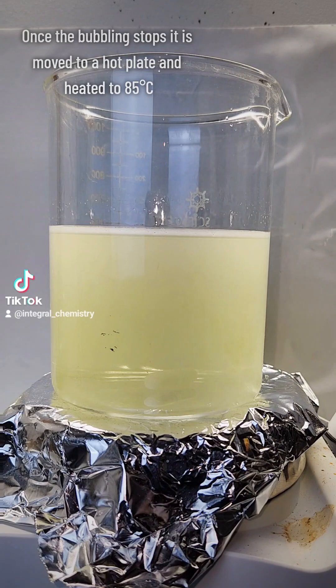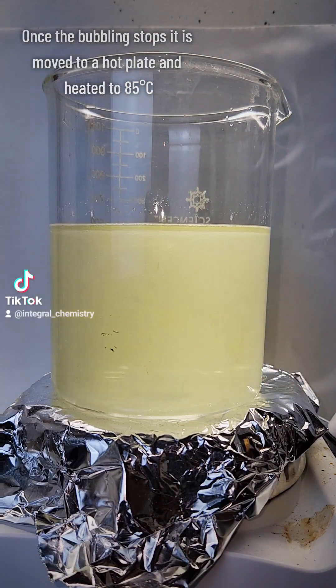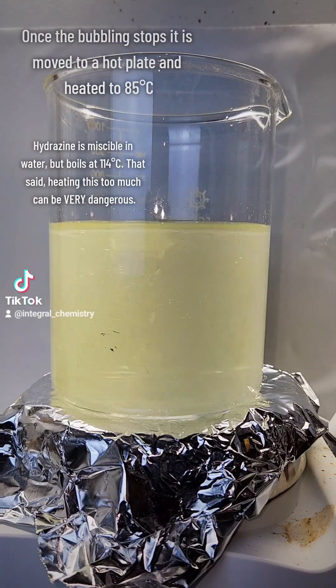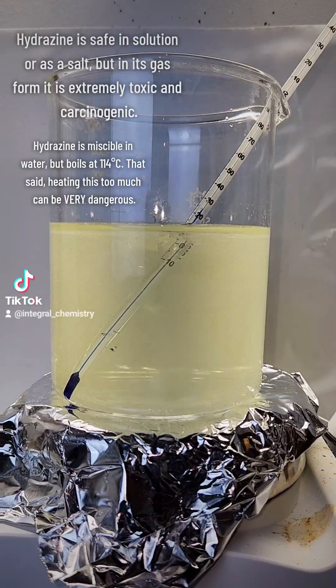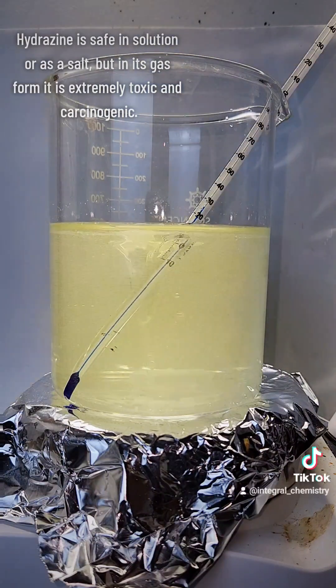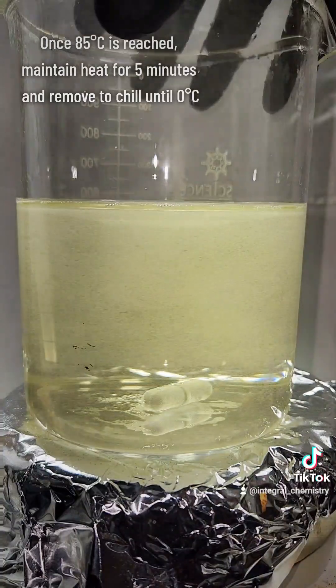Eventually, this will settle into an equilibrium and the bubbling will stop. At this point, the beaker is transferred to a hot plate and heated to 85 degrees Celsius to push the reaction to completion. It's really important not to go too far above 85 degrees Celsius, as hydrazine will begin to vaporize at 114 degrees Celsius, which would be a bad time.